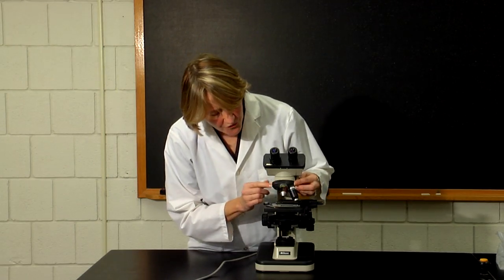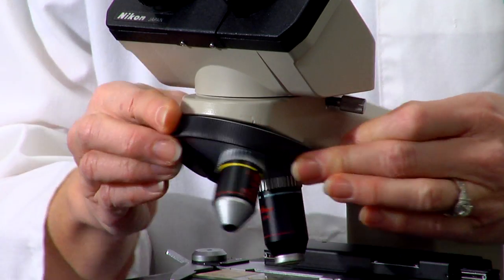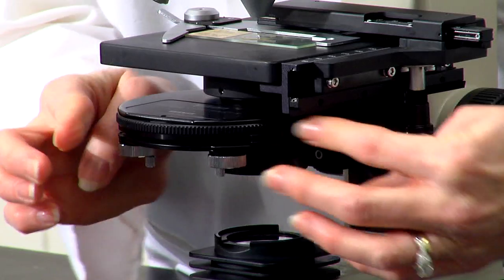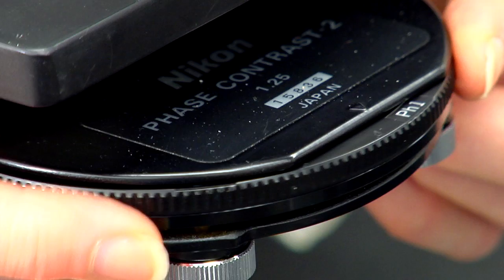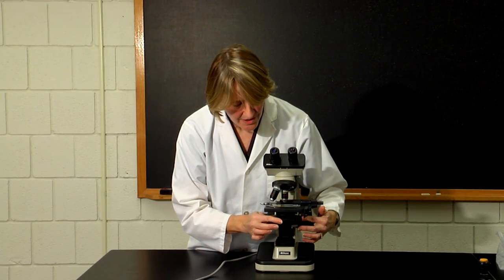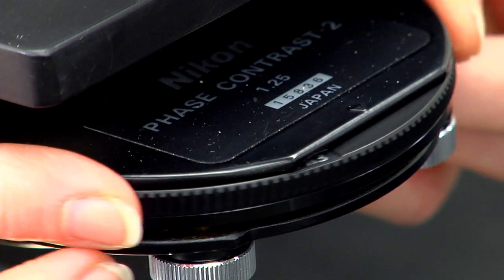So if you'll notice, for the 10x lens, you need to use the pH 1 or phase 1. So we would adjust the ring to pH 1. But notice that it also has other phases. You have phase 2, 3, and 4 as well.